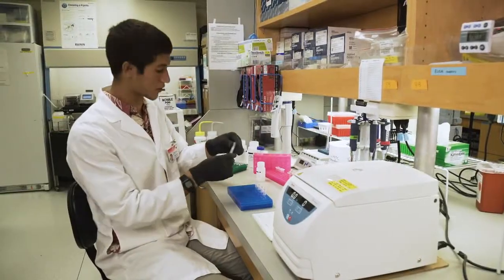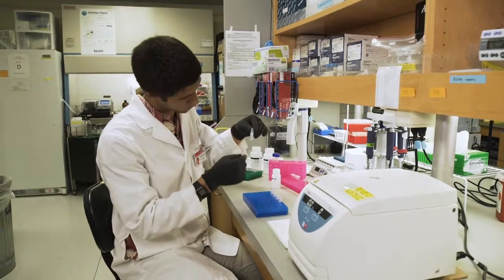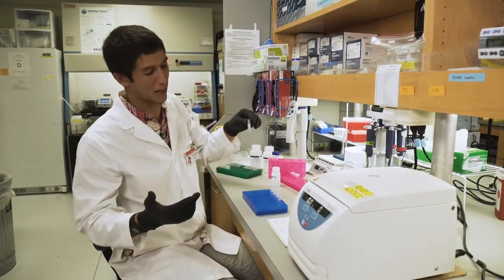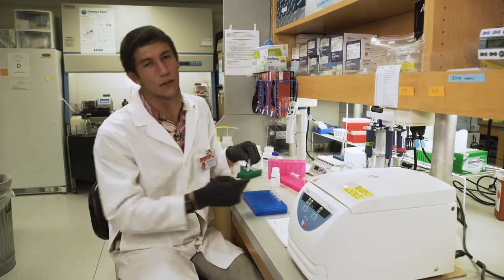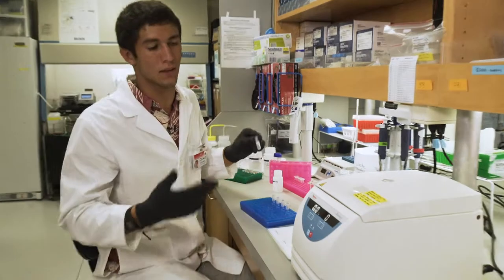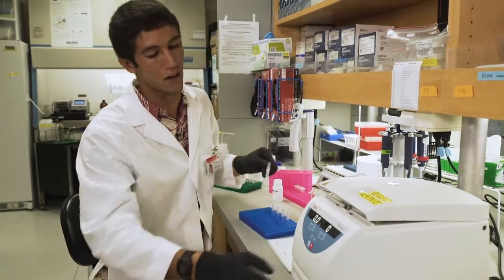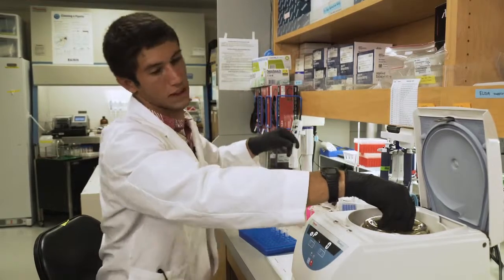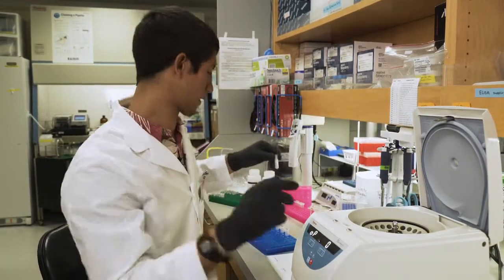All right, so our samples have incubated for 5 minutes, which is just a fancy word for incubate at room temp, just means let them sit. If you stick the things in the incubator, then it controls the temperature and it's warm in there, which helps the digestion process. But for this, we just have to let it sit and soak.